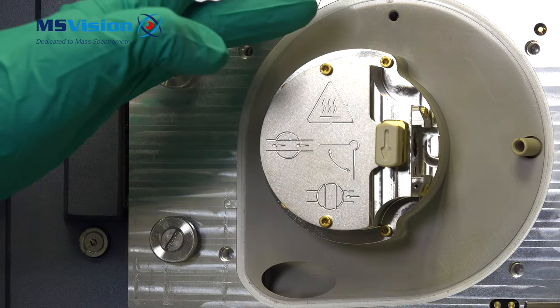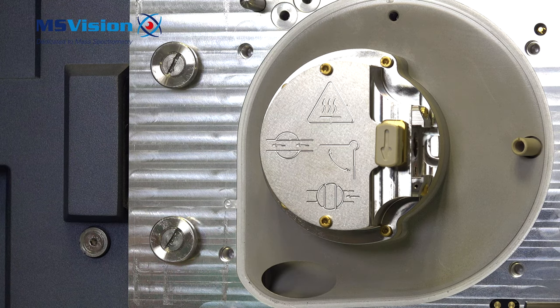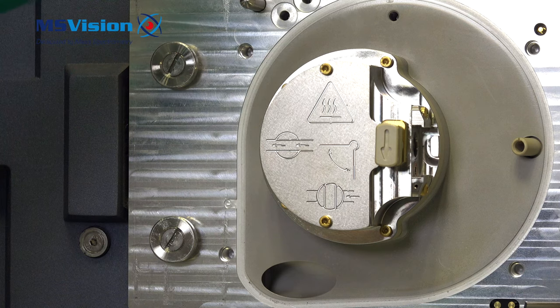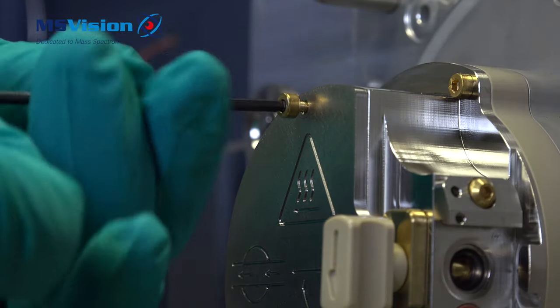Ensure that the source block has cooled down as it can be very hot before we can remove the source. For safety, please take out the mains power lead. We can now open to show the heater and remove the source block.